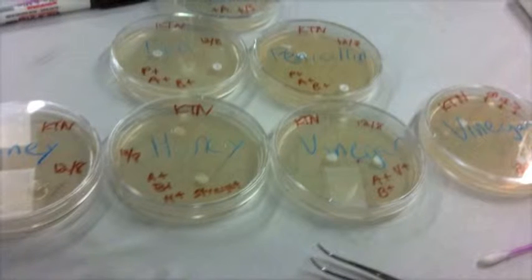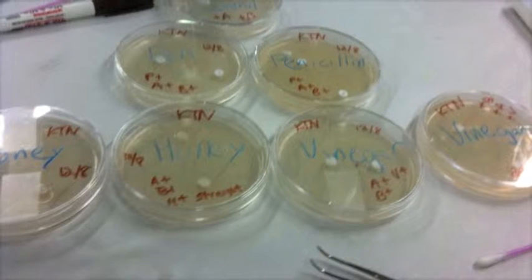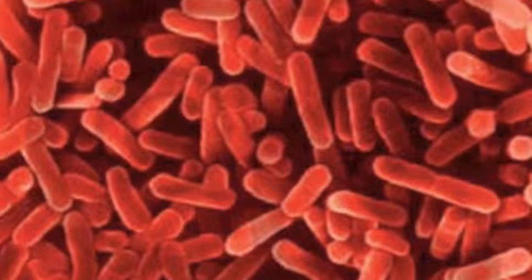The next thing we had to do was clearly label which dishes would be used for which of our treatments. We took spit from Nick Wombat Borelli's mouth and put it on each of the agar dishes. We used 3 different treatments.